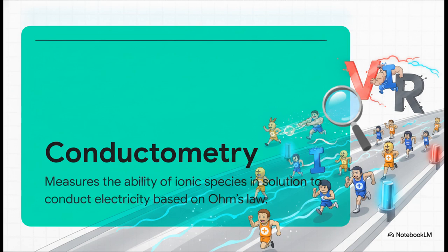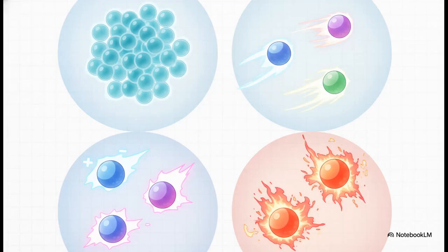In liquids, we aren't dealing with copper wires. Instead, ions act as our mobile charge carriers. It helps to think of these ions like runners in a microscopic relay race, actively passing electrical current through a solution from one point to another. Now, the speed of this electrical relay race isn't constant. It depends entirely on four critical variables.